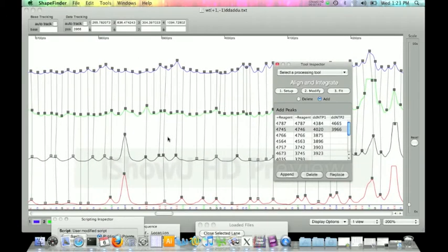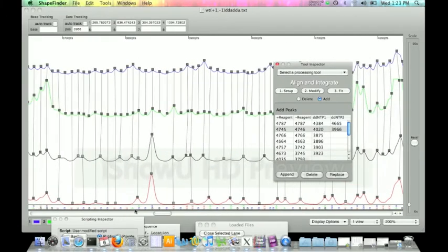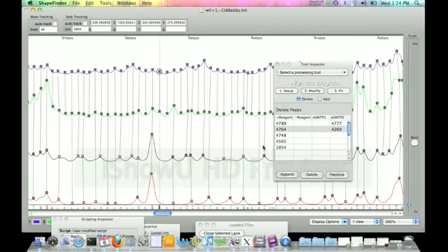We see that we have, again, a shift, A with the A. So clearly this A needs to be moved over another peak. So where can we add it? That's your discretion. Basically what you have to do is look between our A here and our U's here where it's lined up, and somewhere in this region you have to add a peak to line it up. You're not necessarily confident that the peak you're going to get is the right peak, but you have to add it in again for the sake of the ladders.